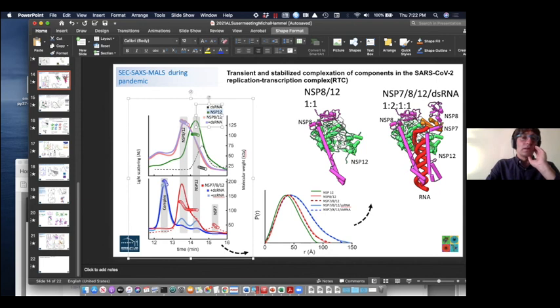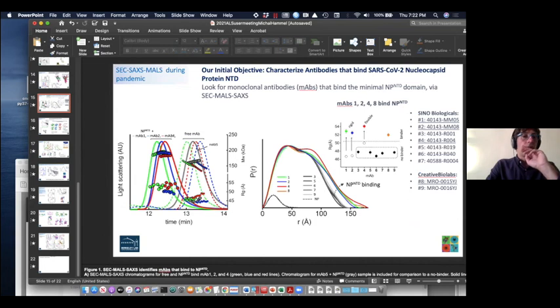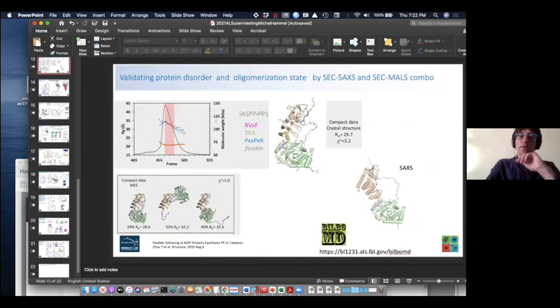Oligomers is the main thing. This is another example where you have hexamer versus octamer. I don't want to go into details here. Everywhere we look at some significant project, this is ASPP, PP1, there are small unspecific dimers or whatever it is, maybe some coupling of two PP1s or two ASPP with one PP1. We need to separate this signal before we can do all this beautiful modeling and come up with the models.